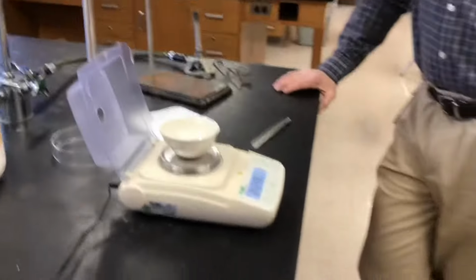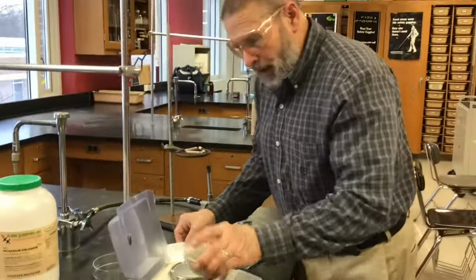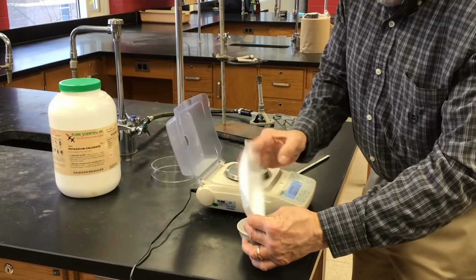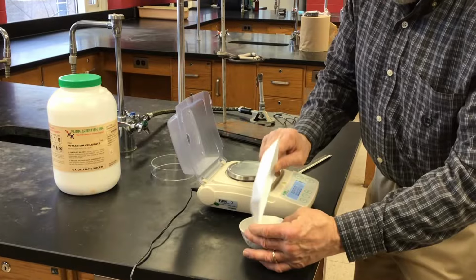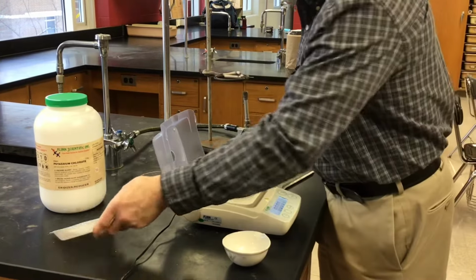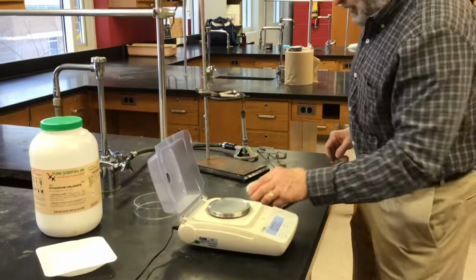So what we'll do then is we'll add our potassium chlorate to that. Make sure it all falls into the dish. And essentially now we're going to heat it.